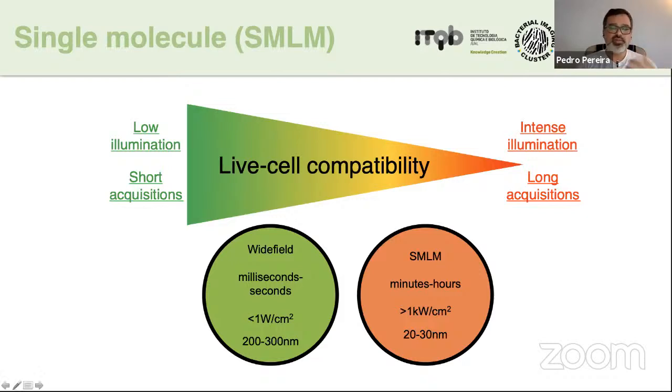So as I told you, single molecule is not very live cell compatible. This is because classical wide field imaging requires low illumination and short acquisitions, and it's very fast, whereas single molecule requires intense illuminations. I didn't show you why, but we can talk about this. Basically, this is how you can get to switch off all of your fluorophores in a sample, and it requires long acquisitions. Because as I told you, you're trading temporal resolution for spatial resolution. Okay, so this is an issue, right?